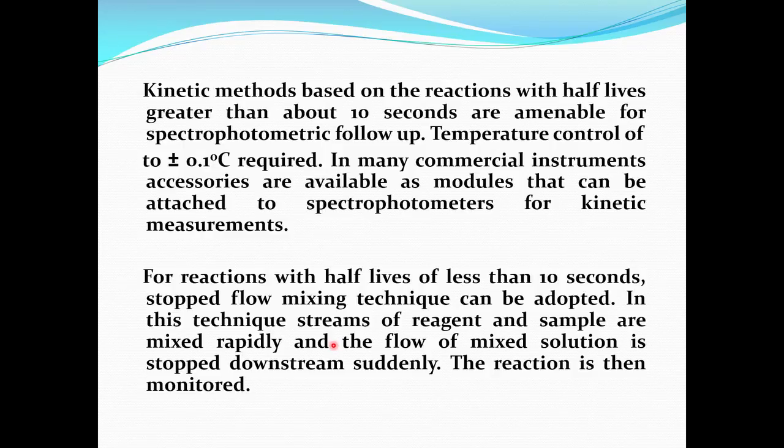So, you have to have a jacketed reactor in which the samples are put, and there should not be any heat changes in the reactor. So, the whole thing must be jacketed with cold water circulating. Many reactions are exothermic and some reactions are endothermic. So, all such fast reactions, exothermic and endothermic reactions, must be very carefully selected and studied using temperature control.